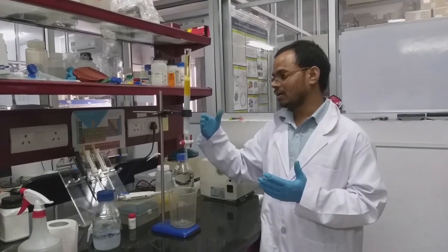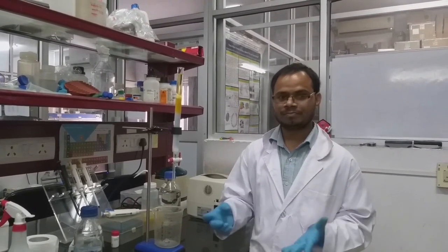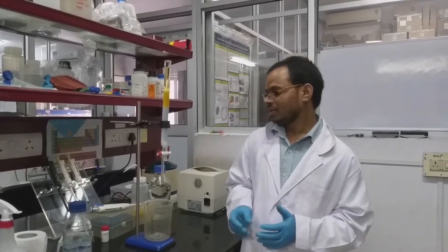Once the separation is over, you have to wash the column with a sufficient amount of buffer and water, and also 0.2 normal sodium hydroxide to remove any suspended particles or any proteins. After that, you can store it in 20% ethanol for further use. You can use it as many times as you want, as long as the beads retain their activity. So this is all about gel filtration chromatography.